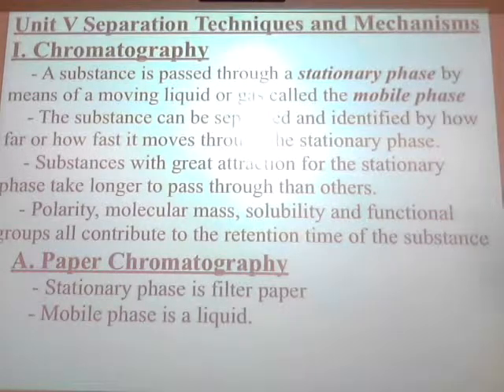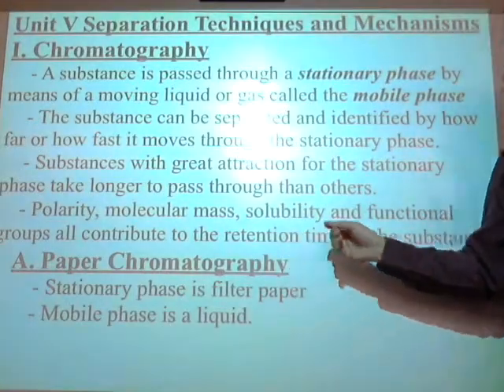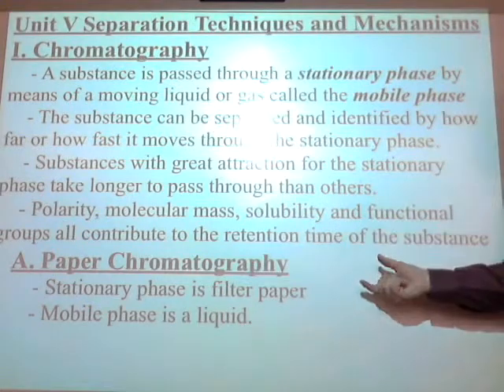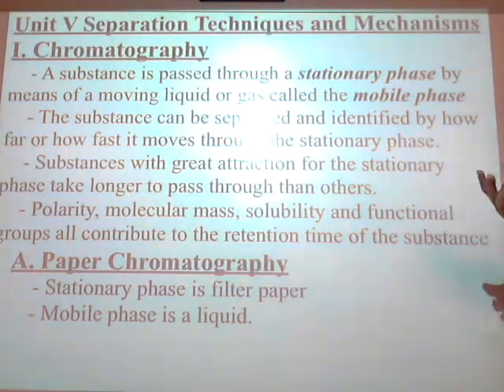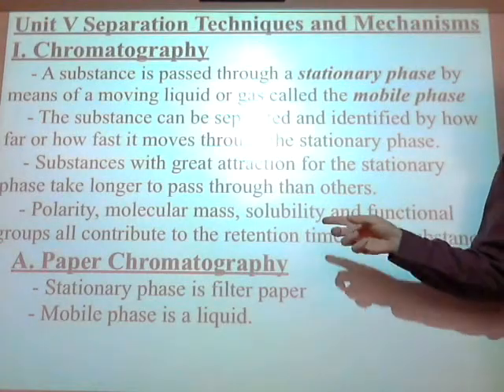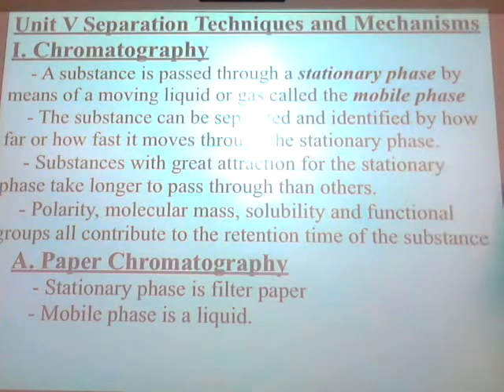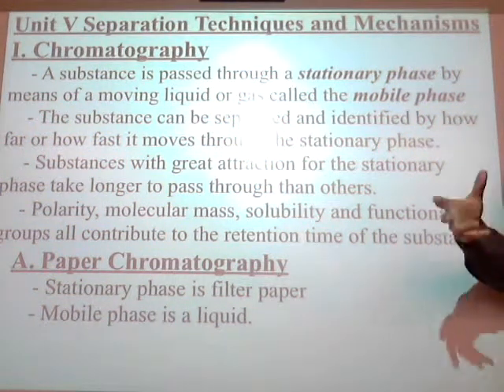Now, I've tried this before, although it's kind of boring. If I have you put a permanent marker on the bottom of that chromatography paper, and the water goes through it, well, the permanent marker is permanent because it's not soluble in water. So what's going to happen to that spot I put at the bottom of the paper? It's not going to go anywhere. It's going to stay there. So it's kind of boring. We don't usually do that when we want to see some results.